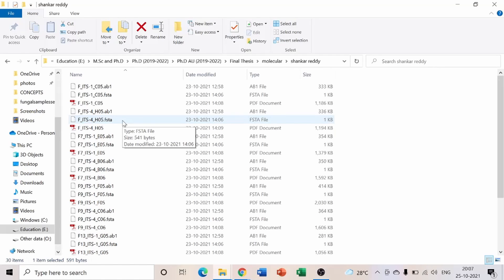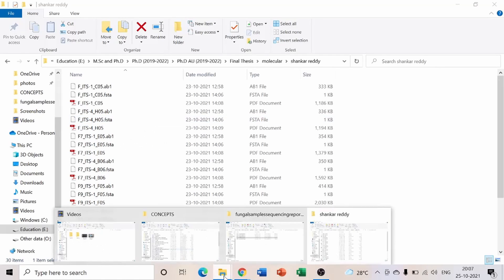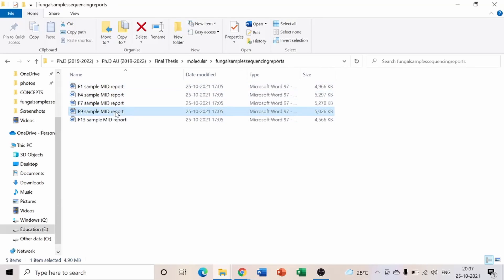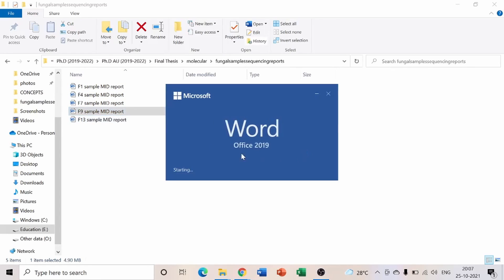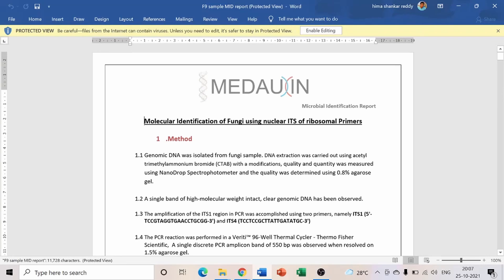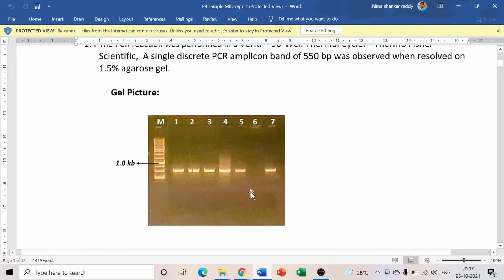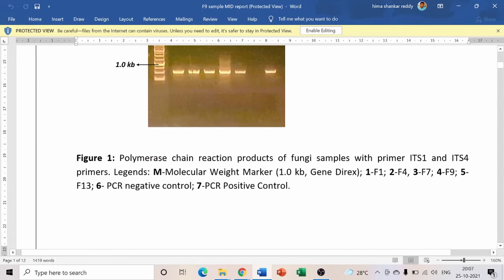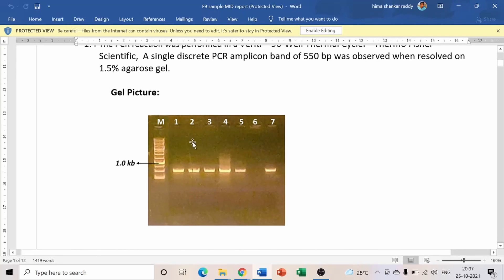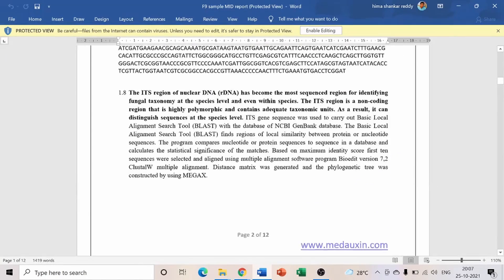The second file is the complete sequencing data. For example, if five fungal cultures were sent one week before, you receive a gel documentation photo showing all five isolates — F1, F4, F7, F9, F13 — along with all the sequence data.